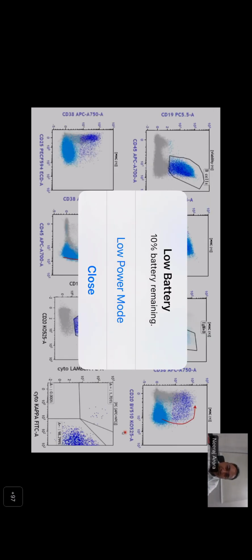So role of flow, Prashant, would you like to take up this? Yes, so as we have seen, there are 2 components in this disease. One is the abnormal clonal B lymphocytes, and we also have plasma cells. Flow cytometry has now become part of the essential criteria as per the WHO 2022, so it is essential to do immunophenotyping by flow cytometry to confirm the diagnosis, where you can identify both B cells as well as plasma cells.